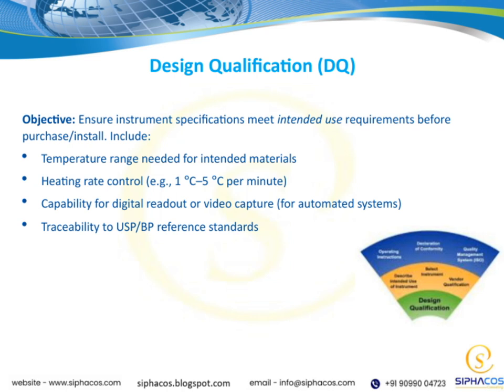This traceability helps us maintain quality and compliance throughout our operations. Overall, DQ is about setting clear, well-defined parameters up front to ensure the instrument will perform reliably and meet our intended use, supporting the integrity of the entire process.